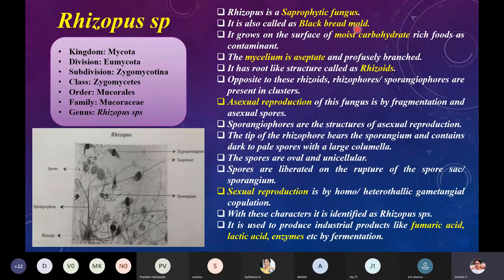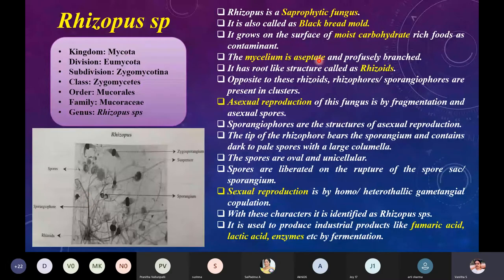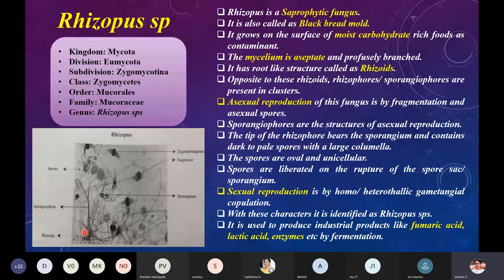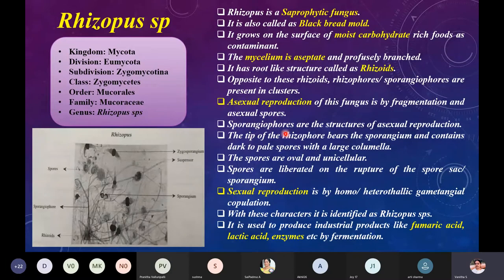Rhizopus is a saprophytic fungus, also called black bread mold. It grows on the surfaces of moist carbohydrate-rich foods as a contaminant. The mycelium is aseptate — meaning it is not divided or segregated — unlike Aspergillus which has septa. The mycelium is profusely branched. It has root-like structures called rhizoids, and opposite to these rhizoids, sporangiophores are present in clusters. Asexual reproduction is by fragmentation and by asexual spores.